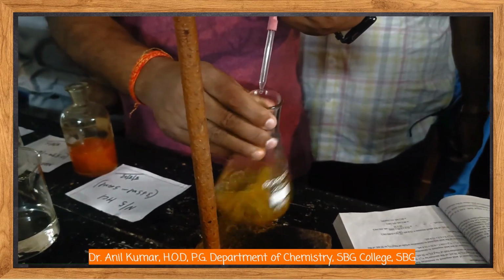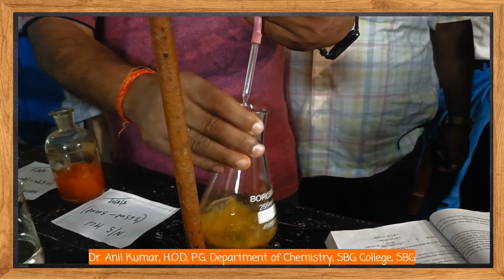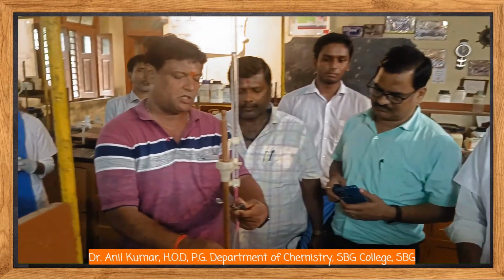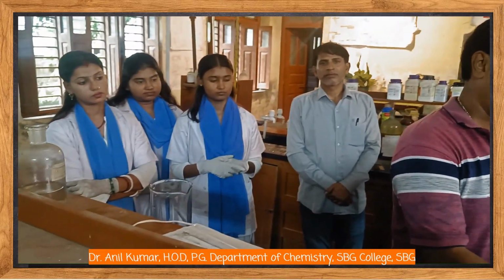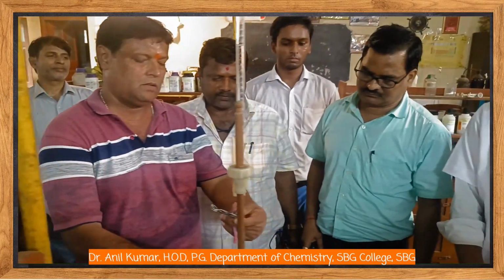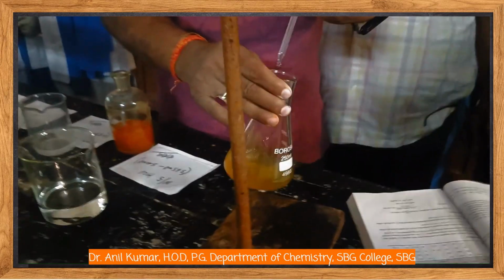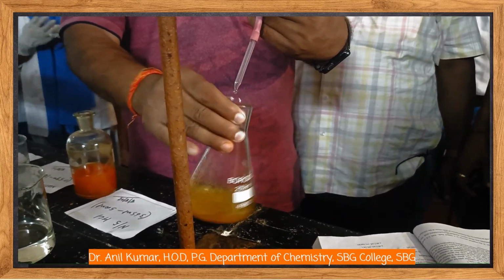We take 10 ml mixed solution from this unit and add 10 ml up to this mark. Okay, once more. Exact. You transfer this into this. Open your finger. Now the whole mixture is transferred, that is, the mixed alkali solution is transferred into the conical flask. Now, this is set for the start of titration.